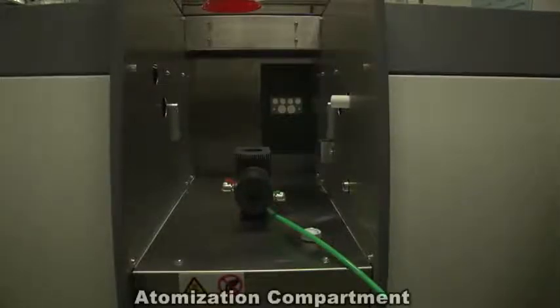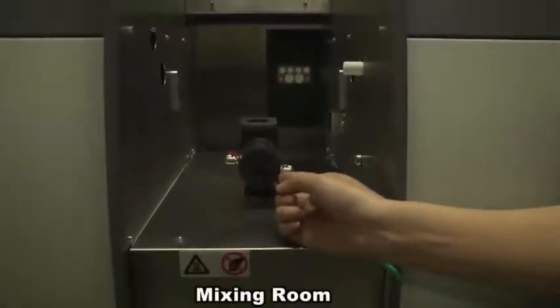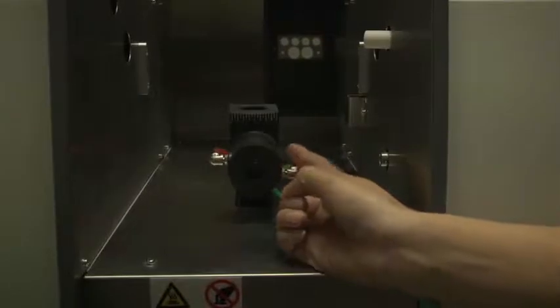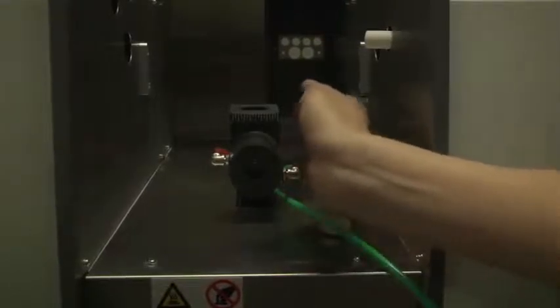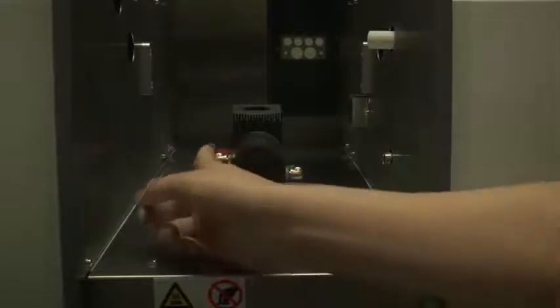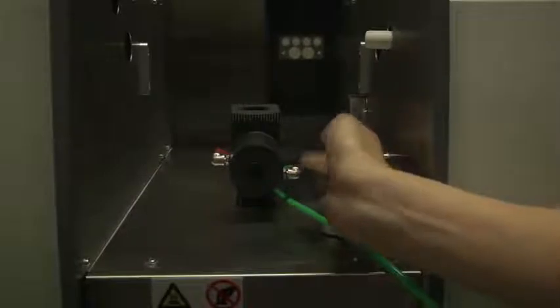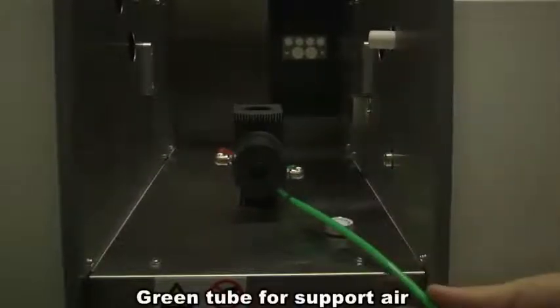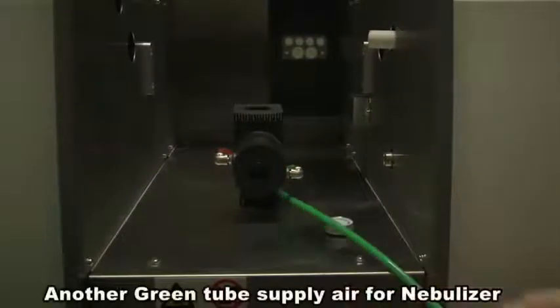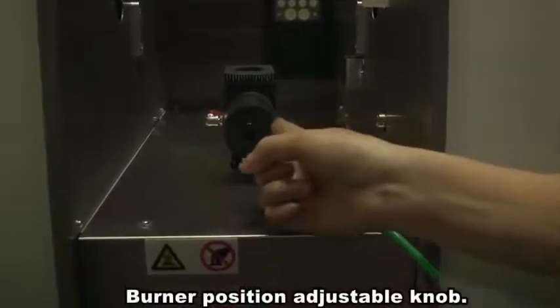In the middle of the instrument is the atomization compartment. This is the mixing room. In the front will connect the nebulizer. The top position is to put the burner. This tube is for accepting gas, and this one is for support air. This bolt is to adjust the position of the burner.